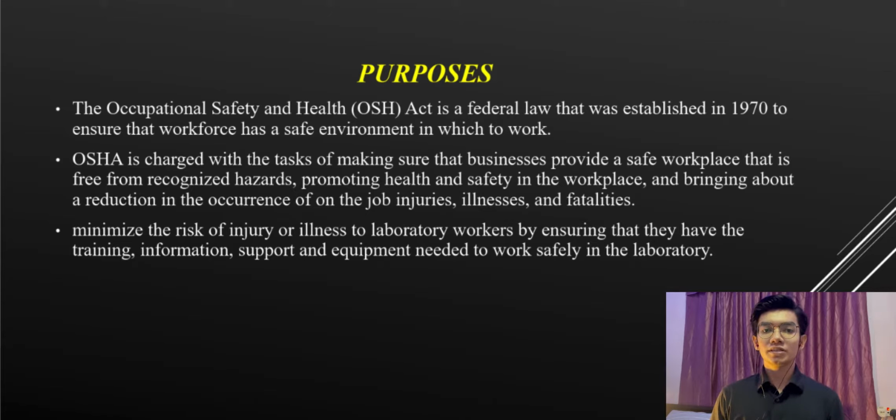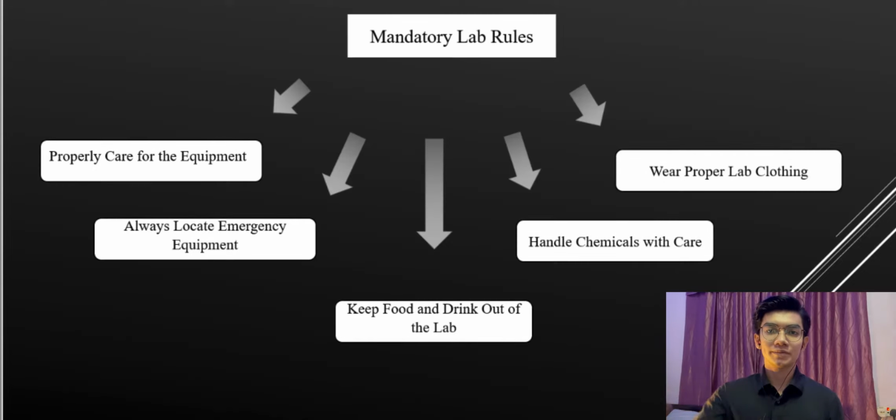OSHA is charged with the task of making sure businesses provide a safe workplace that is free from recognized hazards, promoting health and safety in the workplace, and bringing about a reduction in the occurrence of on-the-job injuries, illness, and fatalities. Lastly, it minimizes the risk of injury and illness to laboratory workers by ensuring that they have the training, information, support, and equipment needed to work safely in the laboratory.